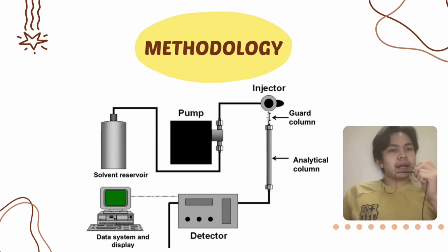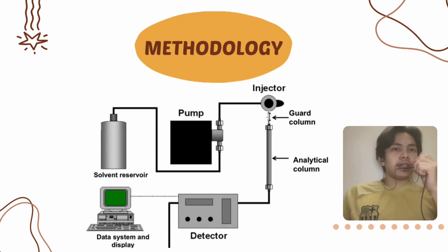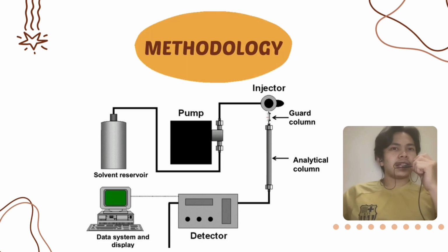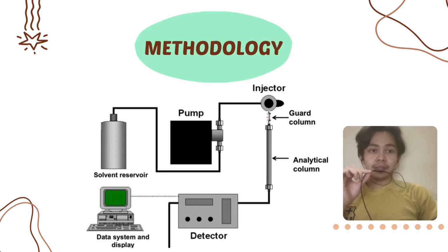Then we go with the elution process. Eventually, each component elutes from the column, meaning it exits the column at a specific time. As the analytes elute, they reach the detector. Now we are almost at the end of this method. I go with the chromatogram.